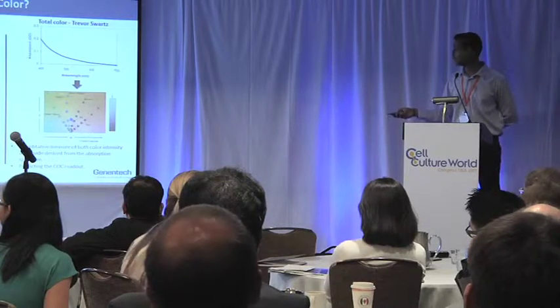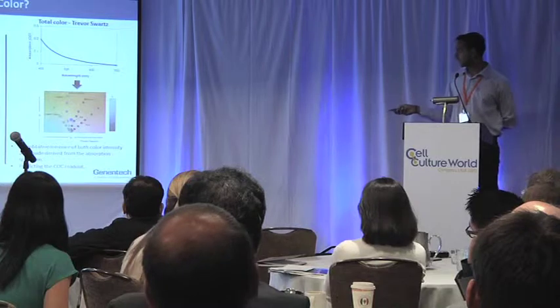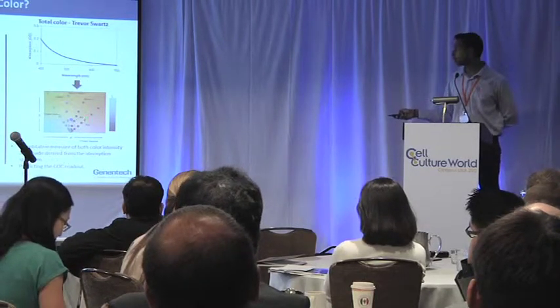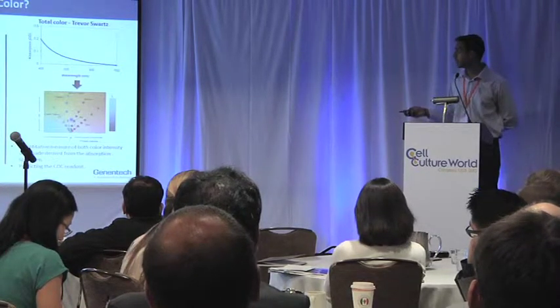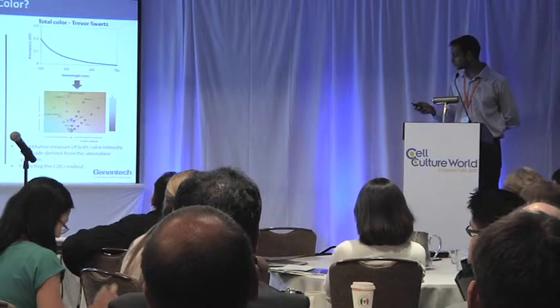And in this method, we're able to pinpoint where the sample falls on this plane. So this method actually not only tells you how intense the color is, but also what shade of color the sample is. And that way actually mimics the COC assay itself much better. And so we also have a readout of a predicted COC value.